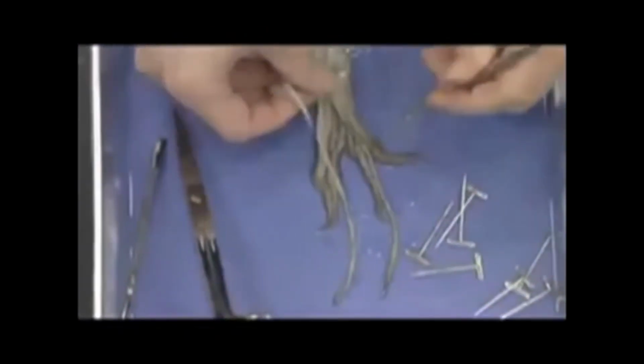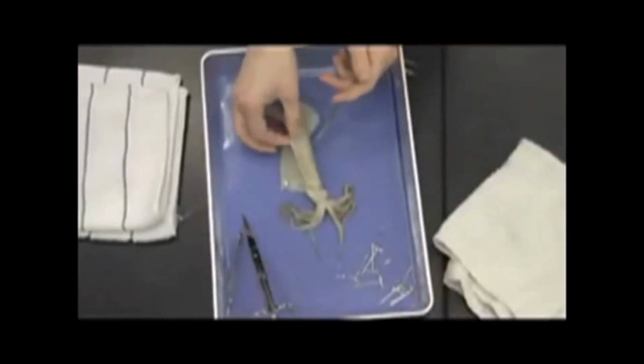Afterwards, take a look at the mouth. Inside all of those arms, if you spread them apart, you can just see the tip of the beak. And you can see a big mass of muscle directly around the beak, which the teacher in this video is showing you with the probe.